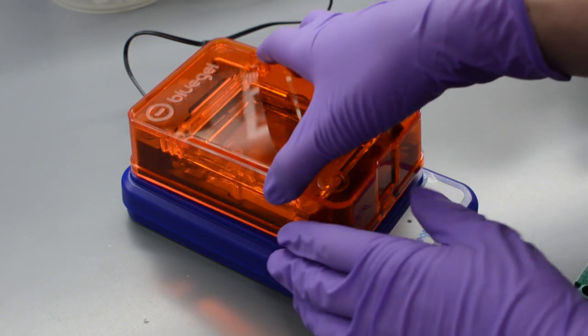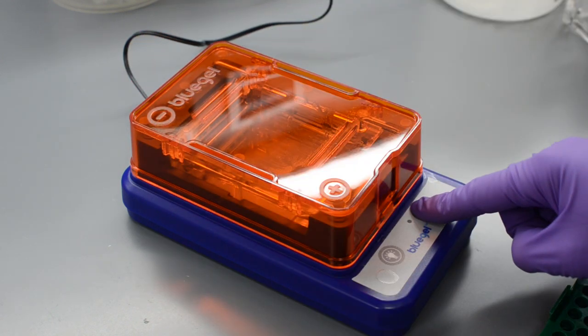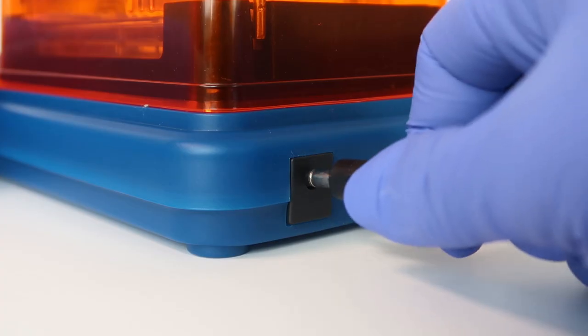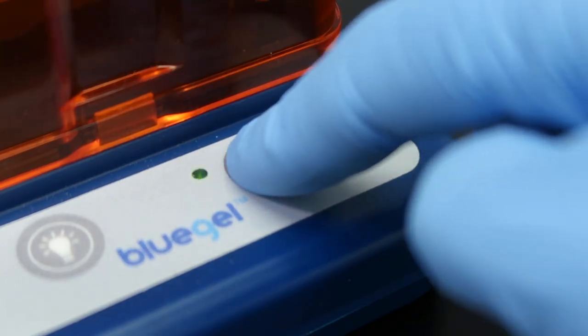Running the gel is as simple as snapping on the cover and pressing the power switch. BlueGel plugs directly into an outlet with no need for additional wires, an external power source, or worry about setting the correct voltage.